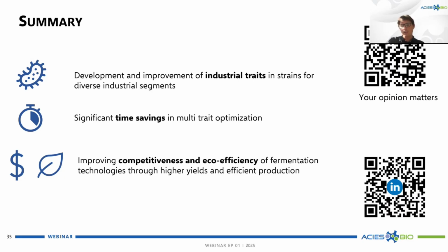Do we get reliable data using high throughput screening using filamentous bacteria? Yeah, I would say so, definitely. In our early days, we were working mostly with actinomyces, which are filamentous bacteria. Of course, it's quite tricky when you do mutagenesis, you have to ensure that this is a single cell clone, so one genome per cell. This can be tricky, but there are ways to achieve this. Usually it's either going through spores, or in the most difficult case, you have to work with protoplasts. This is very difficult, very touchy work, but it can be done.